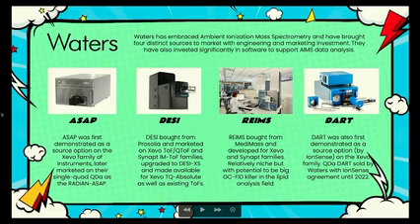They do REIMS. It's a little bit niche, but it has a big potential to do some GC-FID killer work in lipid analysis. If anybody was at ASMS, one of the students that I co-supervise presented on doing double bond positioning using REIMS. So we're still developing the applications in terms of lipid analysis. Lynn's group from Ghent are doing an awful lot of work on laser ablation REIMS as well. So there's a lot of work in the academic sphere to just keep on improving REIMS.